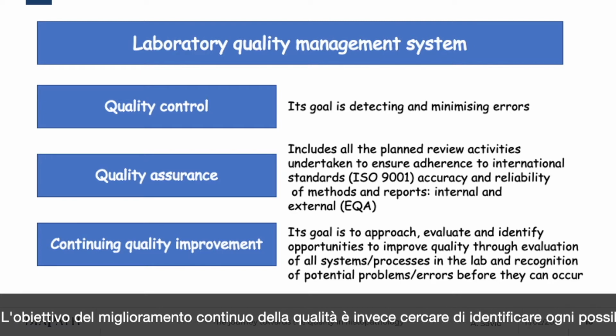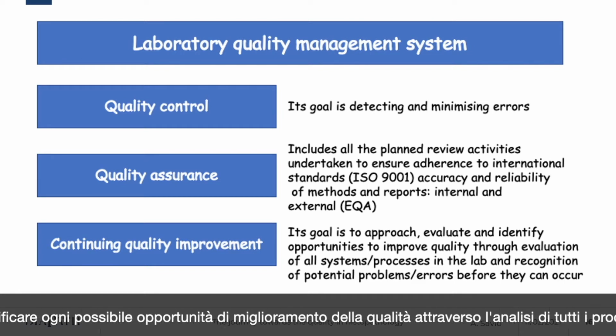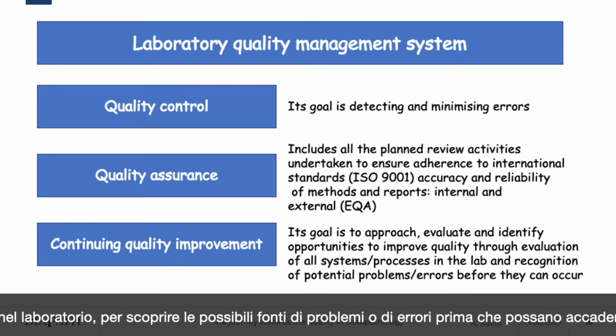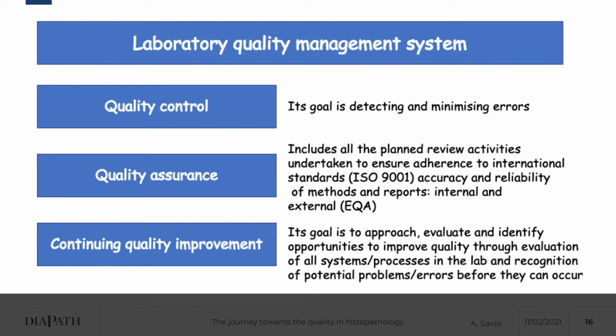The objective of continuing quality improvement is instead trying to identify any possible opportunity to improve the quality through the analysis of all the processes that take place in the laboratory to find out the possible sources of problems or errors before they can happen.